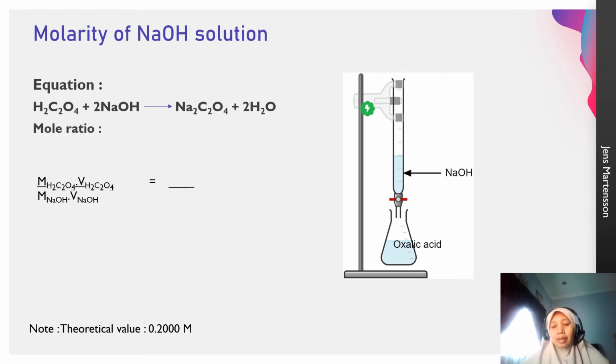The next part is, knowing the volume of NaOH used, we can now determine the molarity. Now remember, in the titration, the NaOH was the titrant and oxalic acid was the analyte. Yeah, titrant and analyte. From the volumetric flask, we took only 25 ml of oxalic acid. Only 25 ml, not the whole bottle per titration. And NaOH, you can refer to the average volume used. Right?